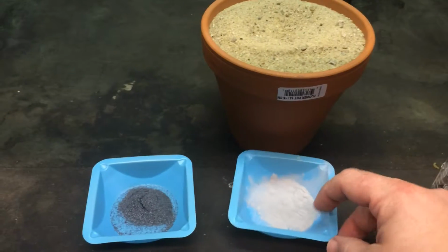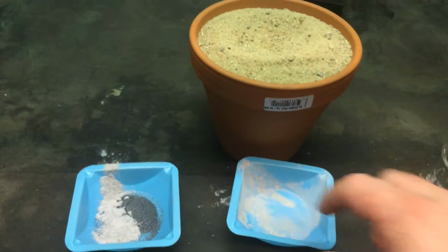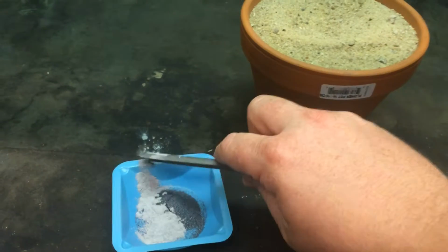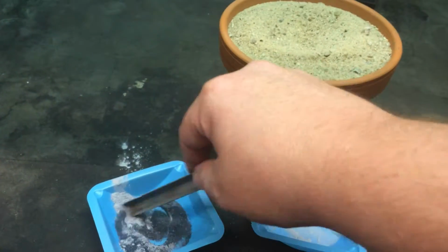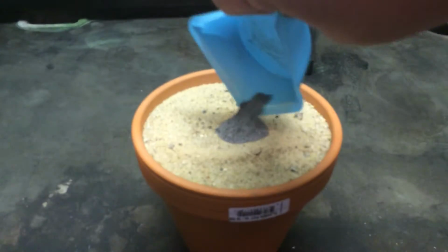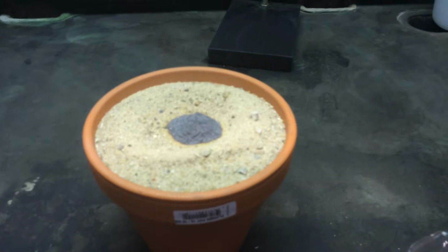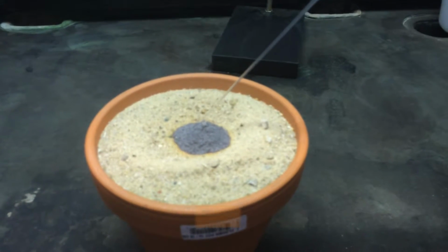We're going to be mixing three things together. We're going to be mixing iodine and aluminum powder, and these will actually start reacting as soon as you mix them. It will take a few minutes for the activation energy to be reached. So we're going to go ahead and hurry it up and put it on a bed of sand. This will contain the heat that's going to be generated later. We're then going to add a little bit of water.